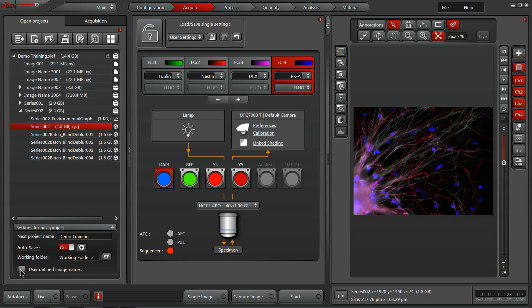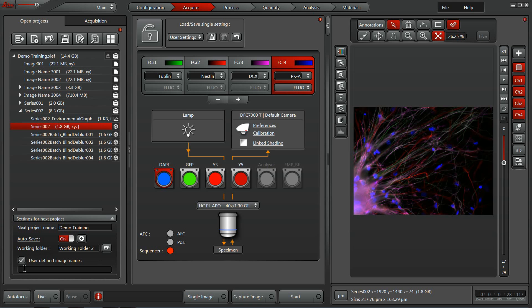At the bottom, you can also activate a user-defined image name. So rather than having the default image name 001, you can put a sample-specific name to help keep your data nice and organized.